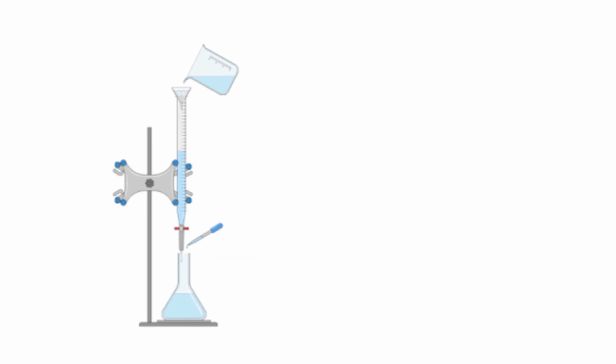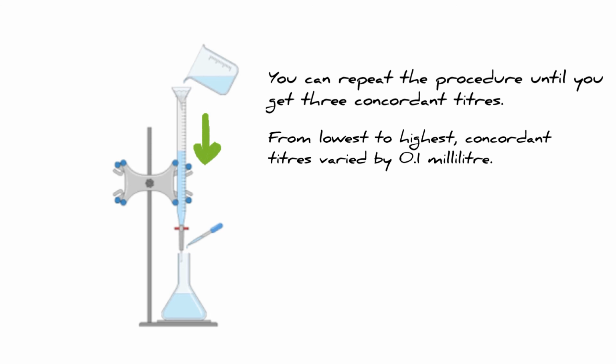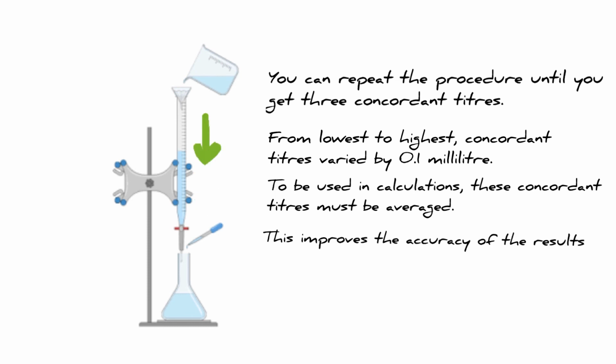This is the endpoint. In the burette, record the final volume. To calculate the total amount of standard solution dispensed from the burette, subtract the initial volume from the final volume. This is the titer. You can repeat the procedure until you get 3 concordant titers. Concordant titers, from lowest to highest, vary by 0.1 milliliter. To be used in calculations, these concordant titers must be averaged. This improves the accuracy of the results.